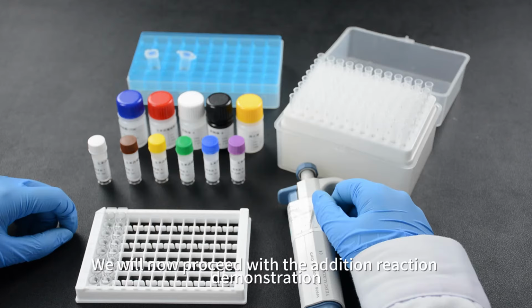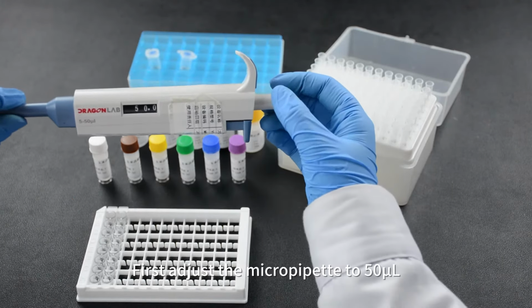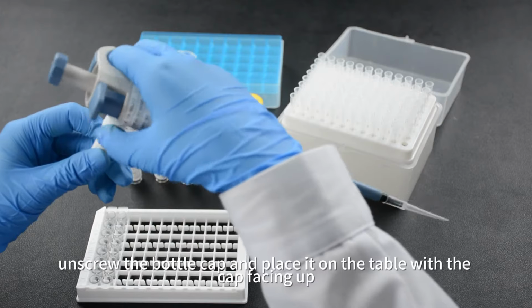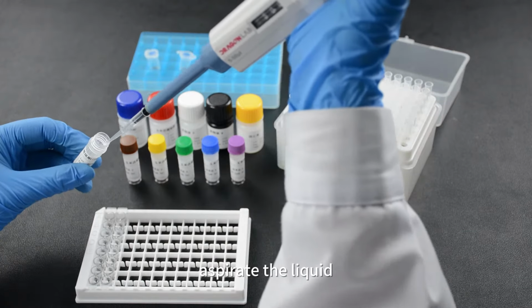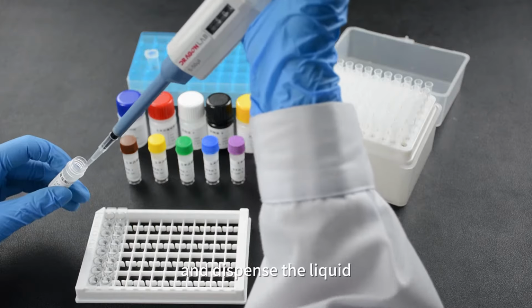We will now proceed with the addition reaction demonstration. According to the instructions, we add the standard first. First, adjust the micropipette to 50 microliters. Attach a pipette tip. Pick up the standard, unscrew the bottle cap and place it on the table with the cap facing up. Immerse the micropipette below the liquid surface. Aspirate the liquid, remove it, suspend it directly above the well, and dispense the liquid.